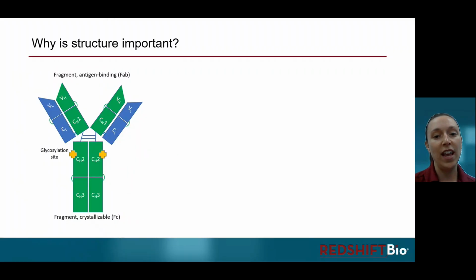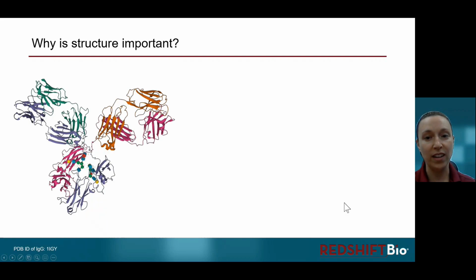The study we'll walk through today focuses on immunoglobulin G, or IgG, and commonly you'll see antibodies like this depicted as a simplified cartoon where you can see the heavy and the light chains clearly distinguished by color, in this case green and blue, and the Fab region that is unique with the variable antigen binding domain. However, on a molecular level, the structure is more complicated and actually mostly made up of antiparallel beta sheet secondary structure, as seen in this figure.